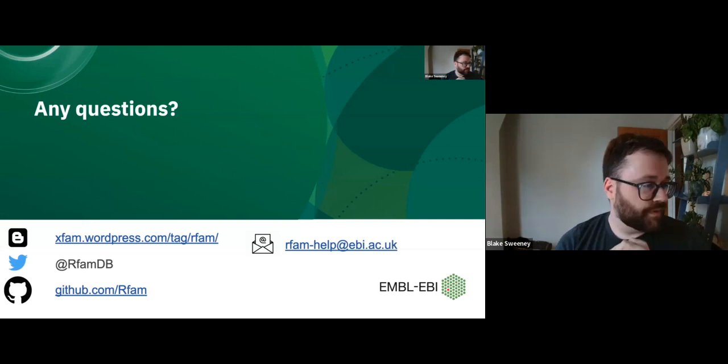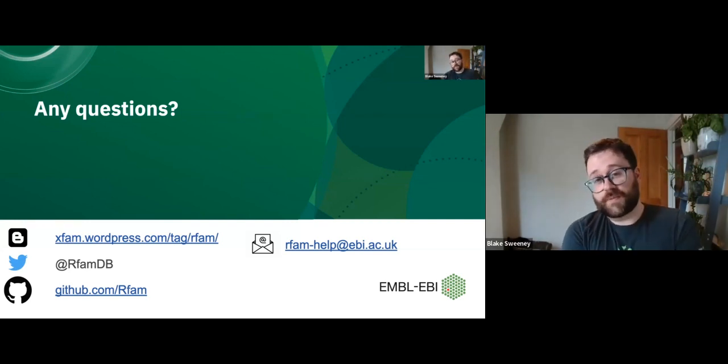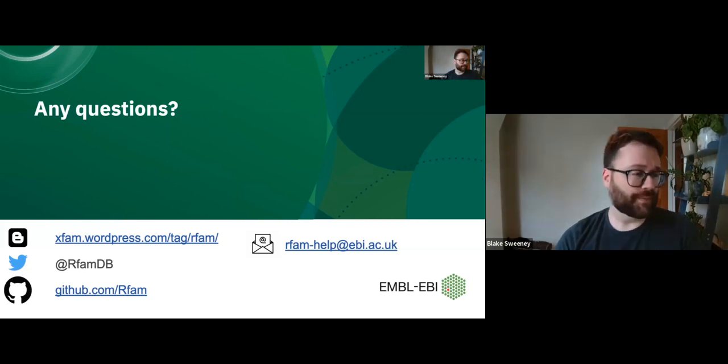What about machine learning? We don't use machine learning to predict the 2D structures. The 2D structures are generally given to us by an author. They may be predicted by the authors, but I don't think we have a large set that are predicted by machine learning. There are 4,000 families, maybe one is, but I don't think that's a significant portion of Rfam.